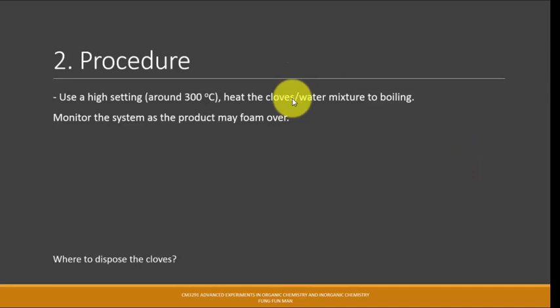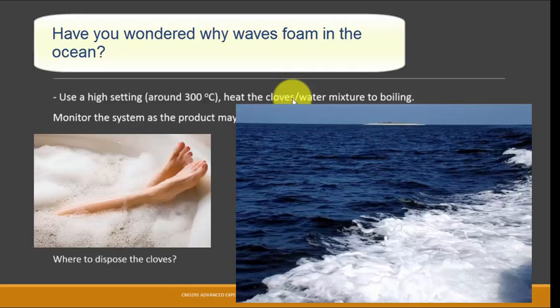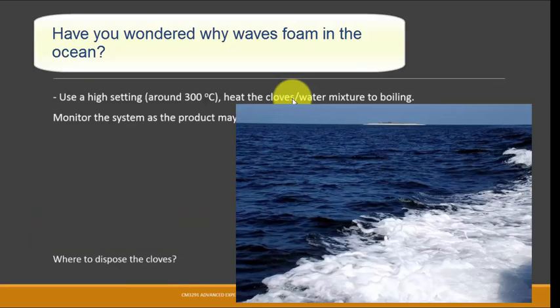You need to heat it up so that this water mixture will start to boil after some time. And again, monitor the system as the product may foam over. Why is there foam? Air bubbles, a lot of bubbles coming out. What will foam? Can water foam? Can an aqueous substance foam? Or only with some oil involved then it foams?